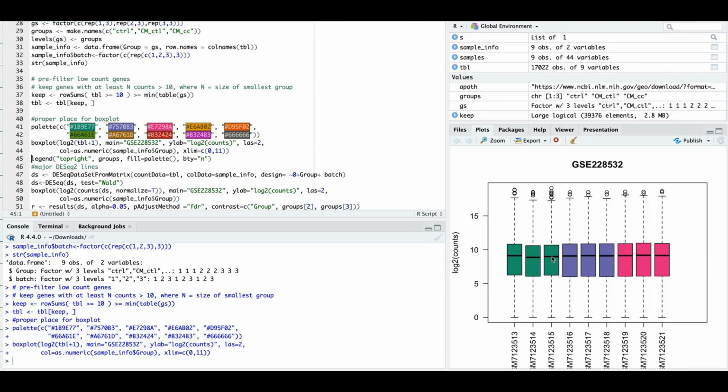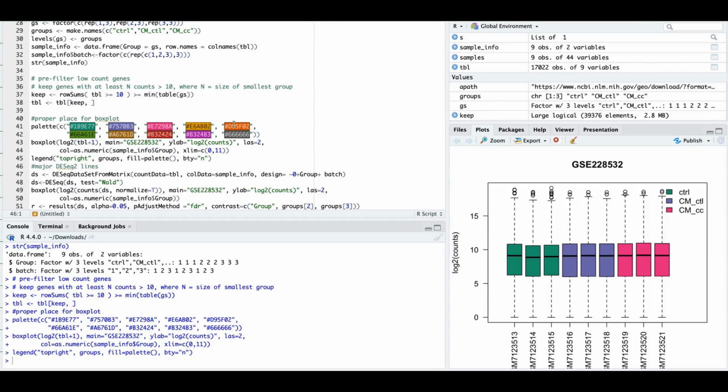And you see immediately that this first group is not good. It is a much smaller distribution. The boxes are smaller than here, and this is where you can foresee the first problem coming. And you can also add legend, why not? And I explicitly changed the xlim to give space for the legend, otherwise you wouldn't have it.